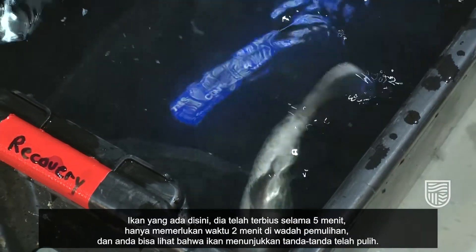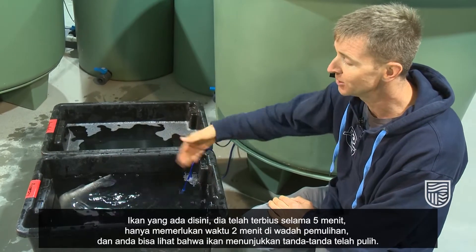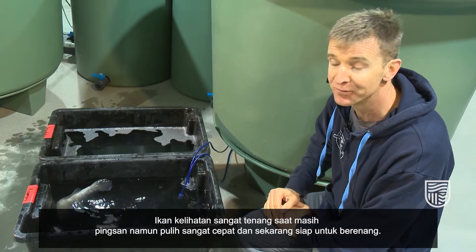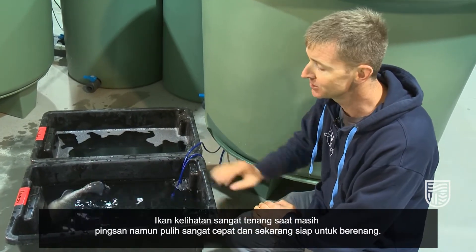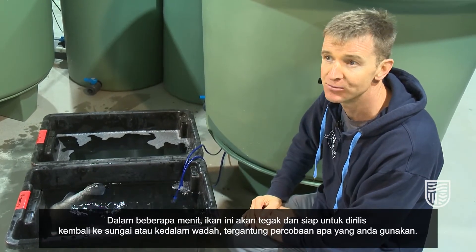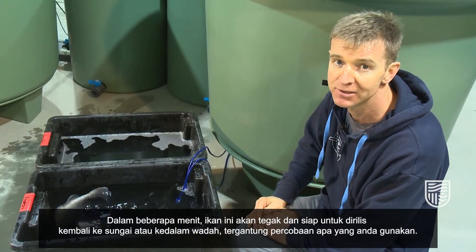So this fish here was in the anesthetic for five minutes. It's only been in the recovery bath for two minutes and you can already see that the fish is actually showing signs of recovery. The fish looks very still when it's asleep, but it recovers very quickly and it's already starting to swim. In a few minutes that fish will be upright and ready to release back to the river or into the tank, whichever you're using for your particular experiment.